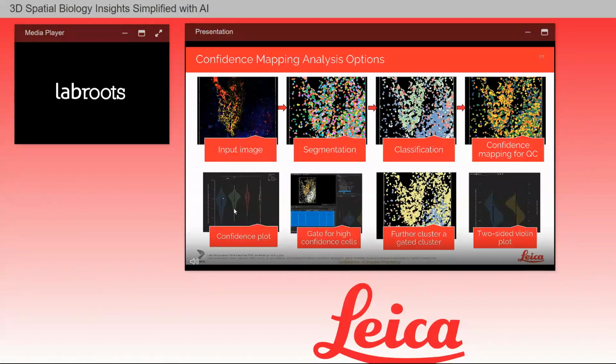After segmentation and phenotyping, confidence mapping can enable you to perform quality control. For instance, you can plot confidence values for different clusters using the violin plot to ensure that all your clusters have a good level of high confidence. You can gate for high confidence objects to create a separate subset. You can further cluster a gated cluster that has the highest confidence or lowest confidence as you choose. Also, using a two-sided violin plot, you can plot confidence and intensity or other morphological measurements in one go.